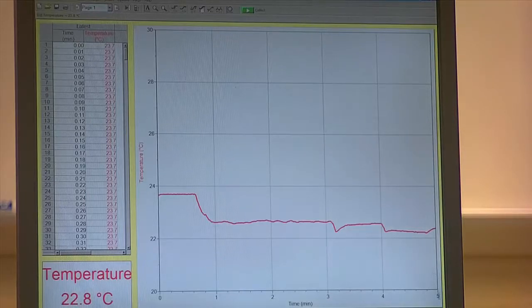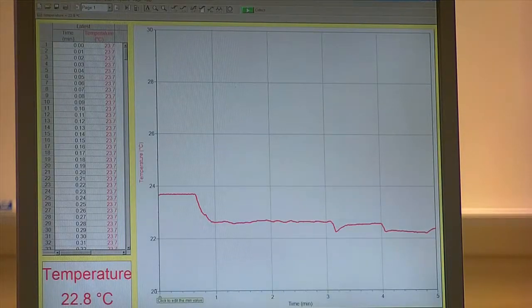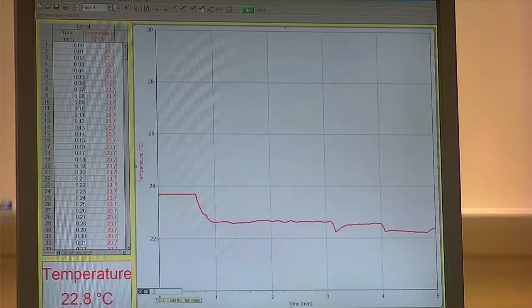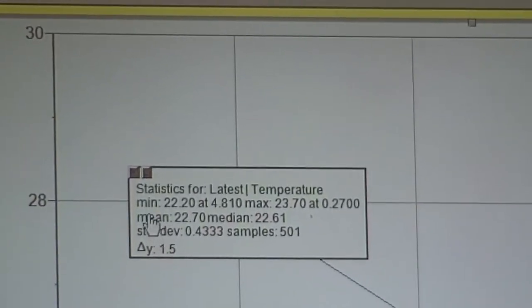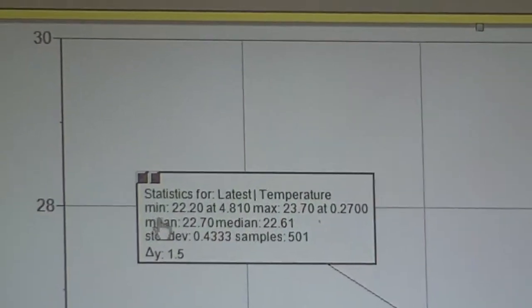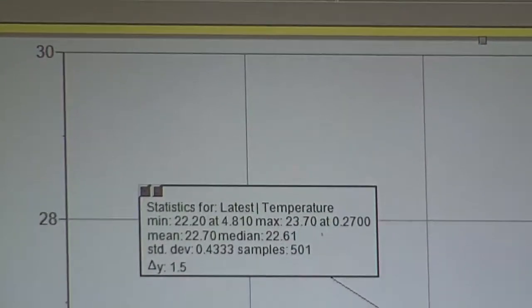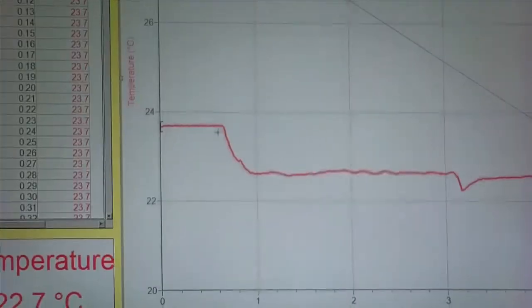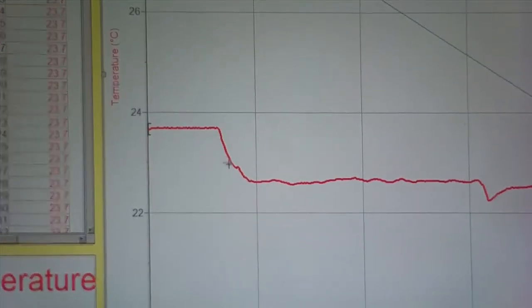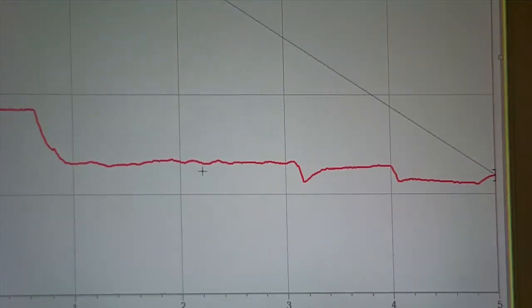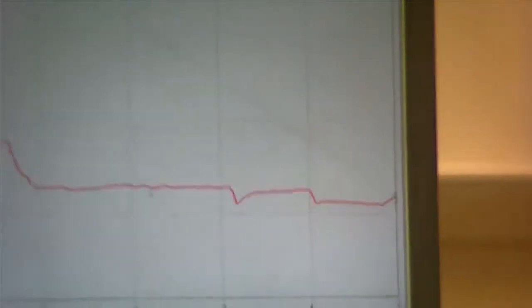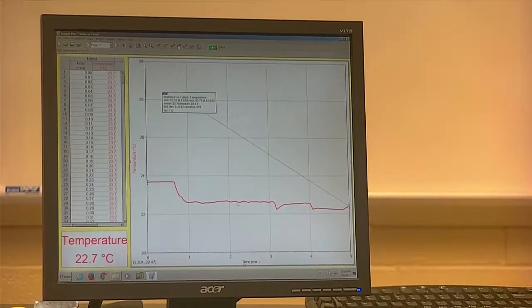This is one run of the addition of NaNO3 to water. We ran the experiment for five minutes. Notice: before the addition of NaNO3, the temperature is stable. Once you add it, the temperature goes down. So that's one hint — the addition of sodium nitrate to water causes the temperature to go down. What does that mean in terms of your delta H?